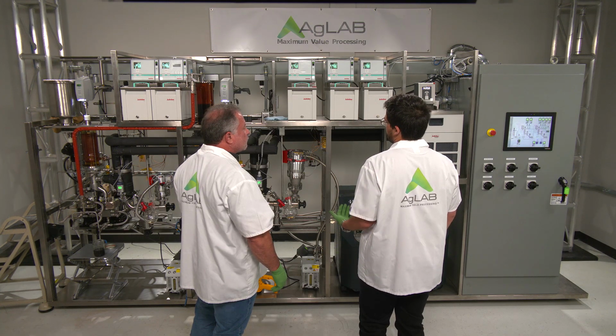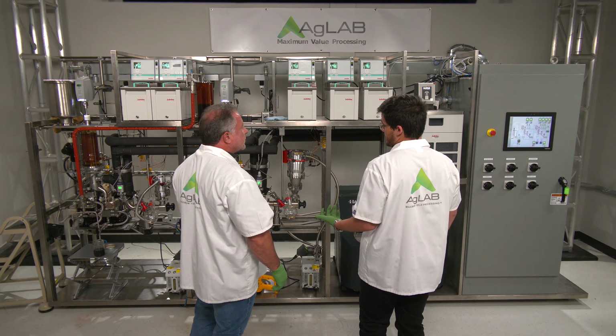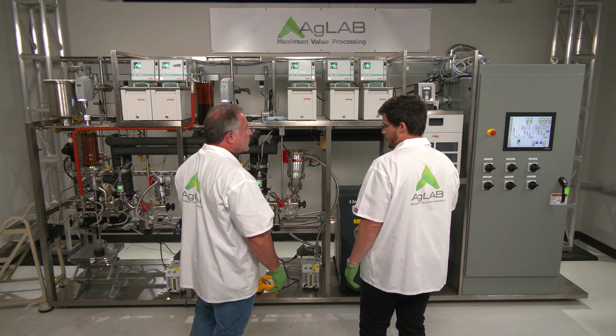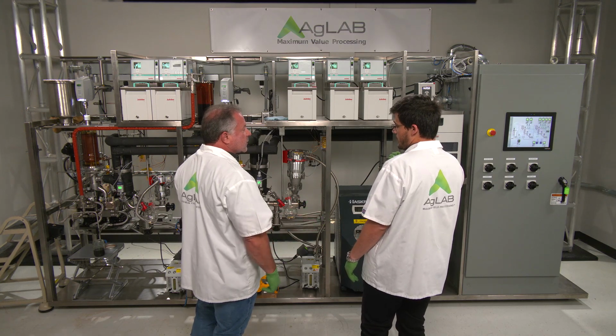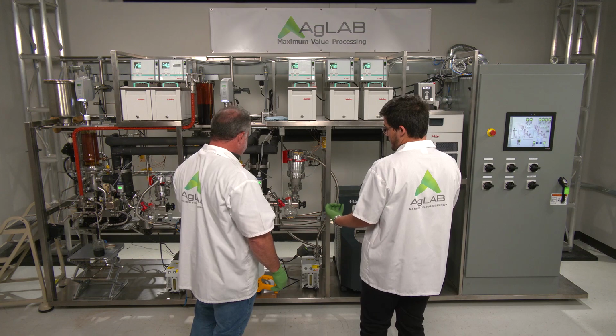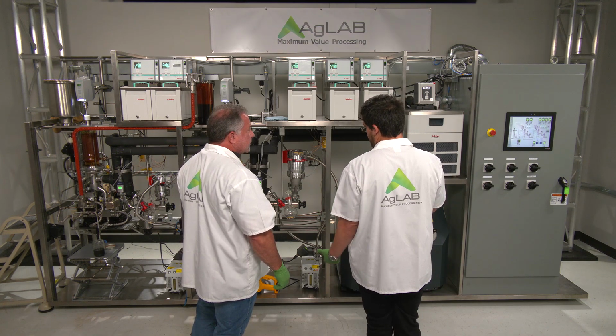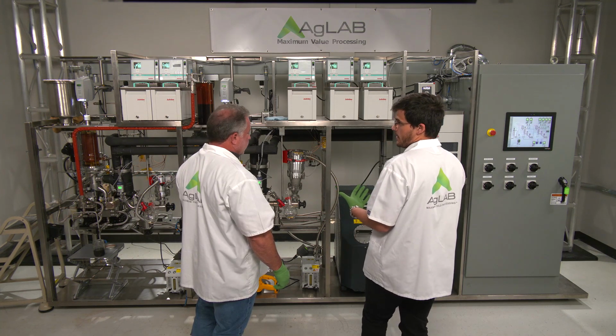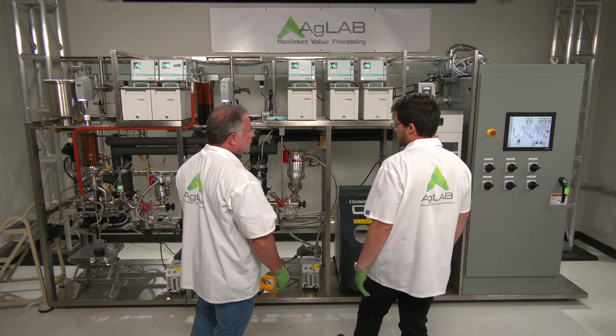So it's got to be hot enough to let lighter components pass by it, and then it's got to be cold enough to allow your molecule to catch onto it. Right. But if you freed up too many things that are heavier than your molecule, in our case, if you freed up tails components and we want CBD, no matter what, it's going to condense with CBD. You can't do anything about it. Correct. So you have to avoid letting the tails material free.